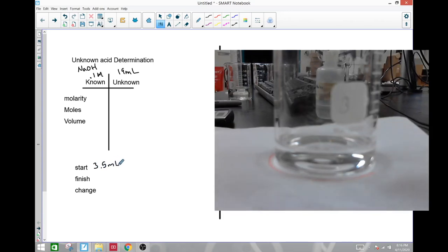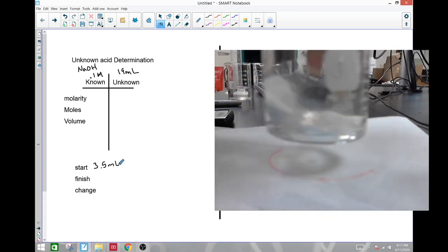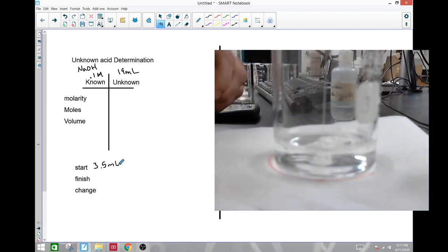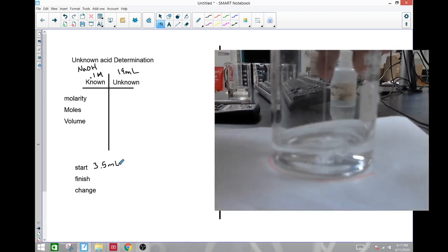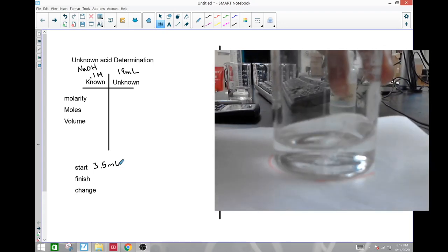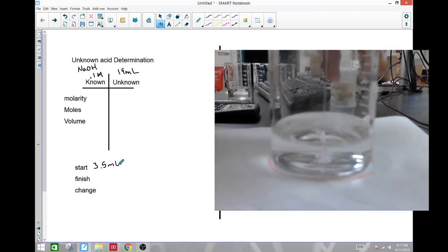Okay, I'm going to start adding the base. I do need to add in a couple of drops of phenolphthalein or it will never change colors, and this will be a disappointing experience. So start adding in. Start watching for signs of pink, occasionally stirring. Seeing a very light pink at the entry point, but nothing really too much yet. A little more pink sticking around a little longer.